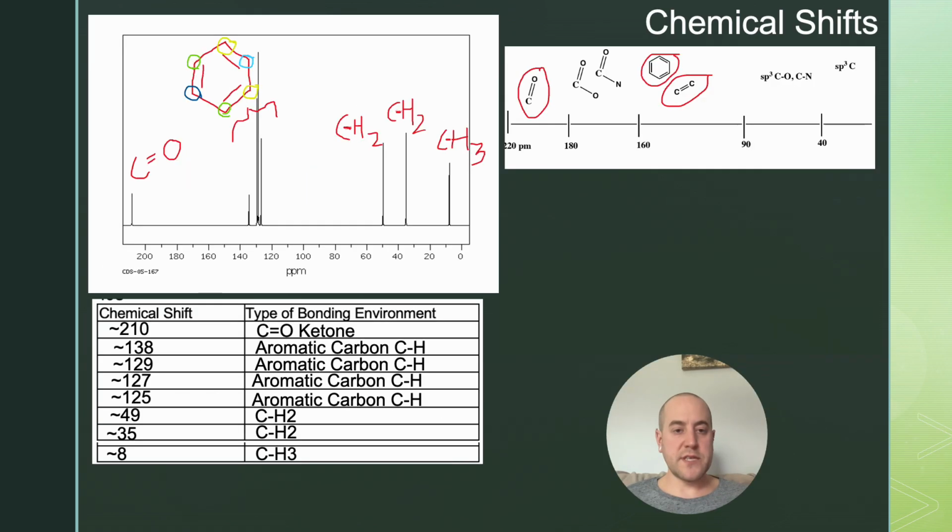Another graph we are given to help determine the structure of the compound is the chemical shifts one. Again, we are provided a key to show what types of bonds are present at what ranges. This graph will help determine the different types of carbon bonds, not the number of carbon bonds, but rather what other atoms they could potentially be bonded to. In this graph, furthest downfield, above the 210 mark, you're looking at a peak similar to the carbon double bonded to an oxygen, the ketone region.